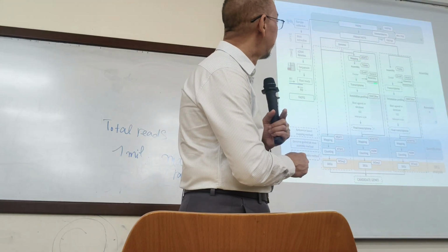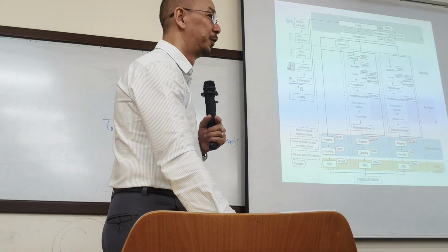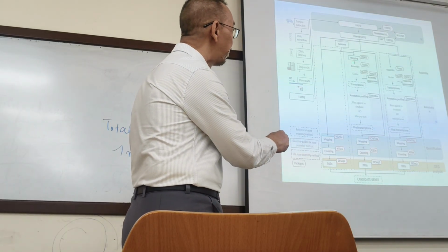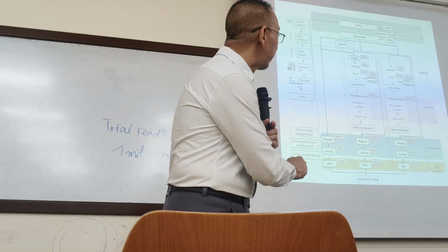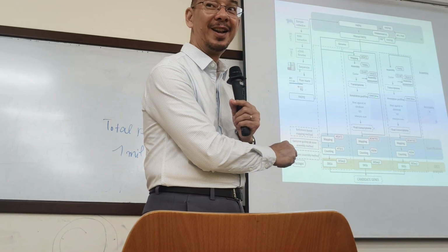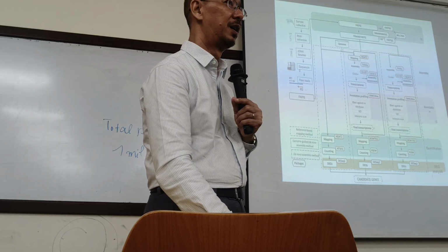So what is the difference between the two here? Can anyone see the difference, one and two? This one is assembly, and this one is mapping before assembly. If mapping before assembly, it means reference-based assembly, remember.